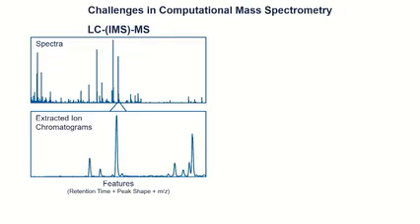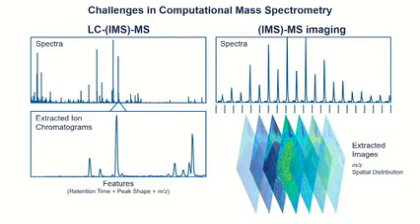So for the first introduction, before we jump into the data processing, we already saw that MZmine incorporates all kinds of MS data, and this is also our goal. We try to build one platform that can handle any kind of mass spec data, and the good thing is we always have the same kind of detector, right? We're detecting mass to charge ratios, or at least we get spectra in the end after some processing. And then we can extract extracted ion chromatograms. We can do this also with ion mobility data, also with imaging.